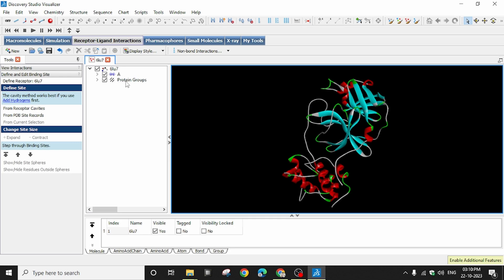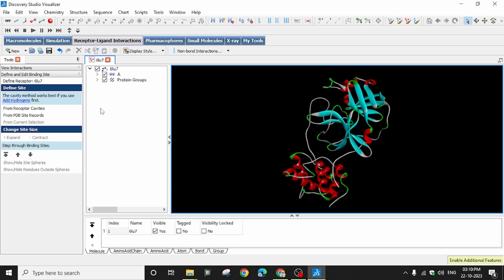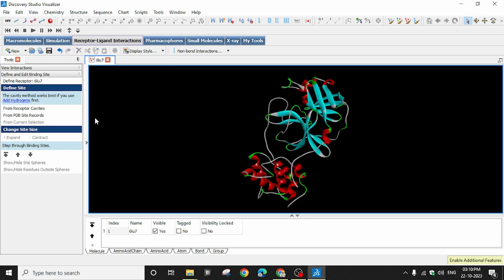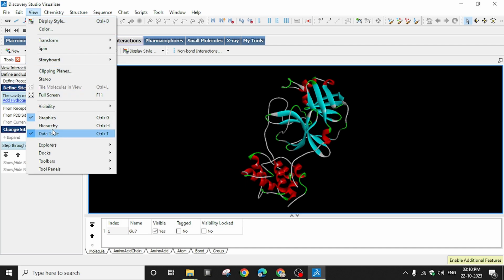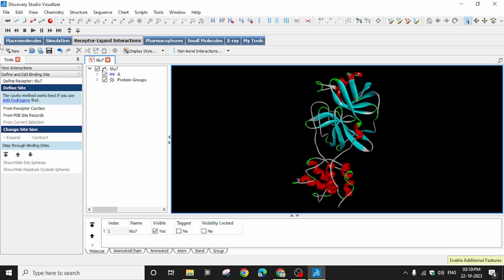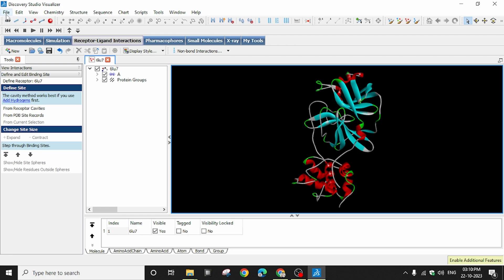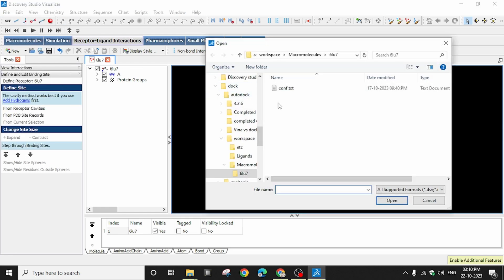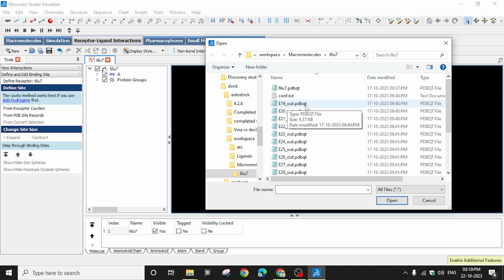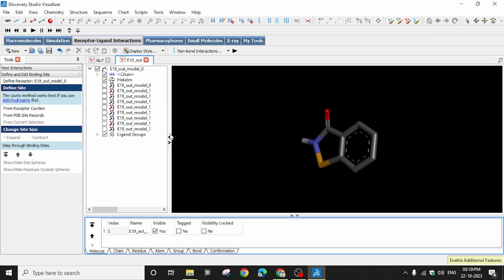You can see only the protein tube — nothing else. Sometimes the hierarchy window may not be visible. If it's not visible, go to View and check 'Hierarchy' to activate it. Without the hierarchy window it will be difficult to perform the various activities. Now the protein PDBQT file is in the hierarchy. We are going to add the ligand PDBQT file — go to File > Open, select 'All Files,' and open E19_out.pdbqt.